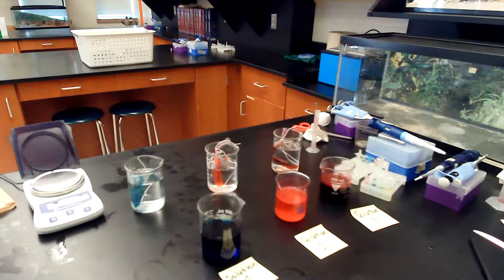Because my setup's like, I feel like you and I know how to use dialysis tubing. Right. So that's what I kind of feel with them. We've got to have it set up, ready to go with the things tied at the bottom and the side. You've got to feel for the opening. Yeah, I agree. We got to set it up.